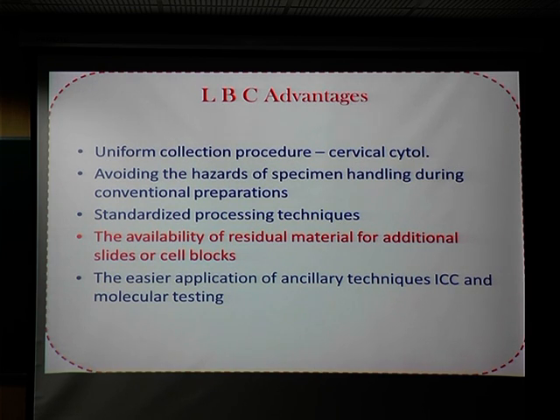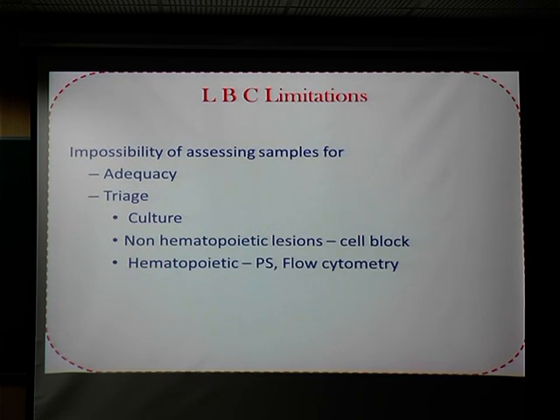and then you can use that material, if you find only a few cells in the first slide, to make one more preparation, which is otherwise not possible when you are doing the conventional smears. So you have residual material remaining, you can use that material for preparation of cell blocks or any other molecular techniques, and that's why a lot of molecular techniques and immunocytochemistry are being done on liquid based preparations.